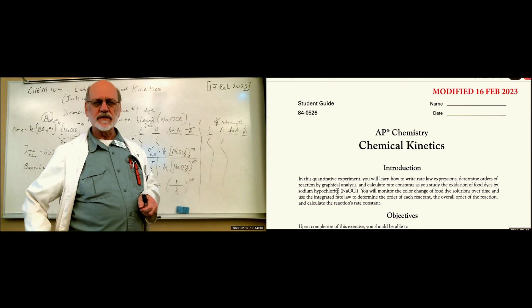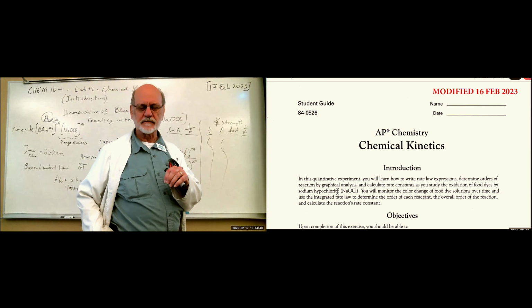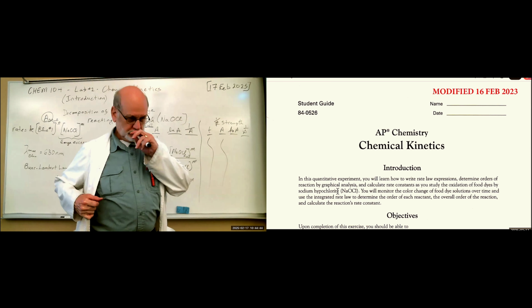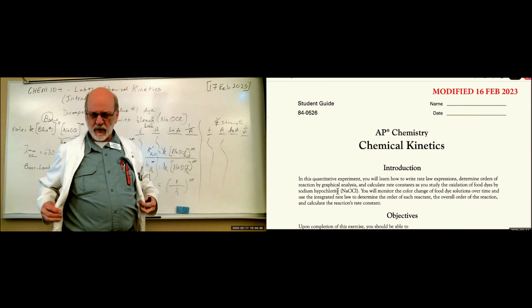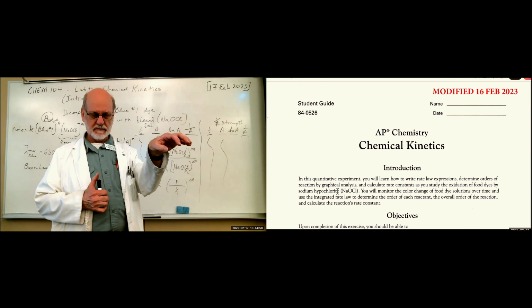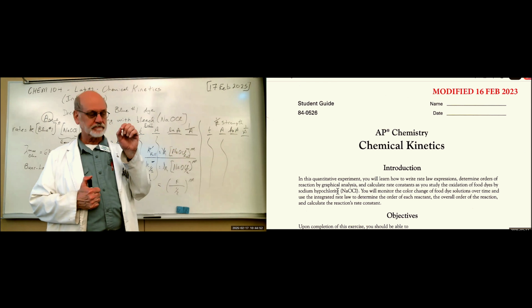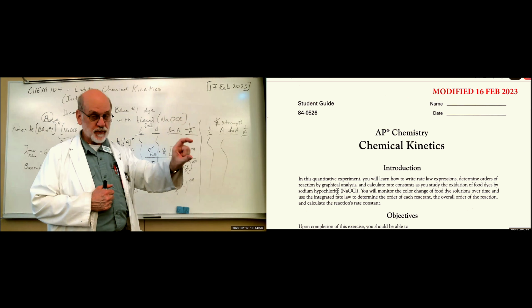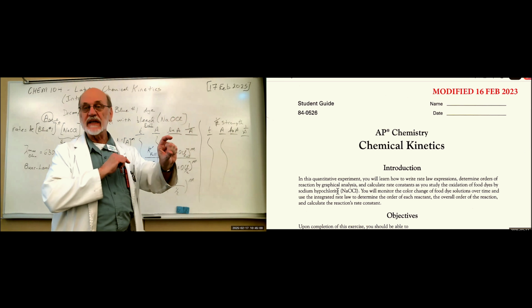The experiment itself requires coordination. Right, got somebody that's actually, because when you finally set up your experiment to occur in the spectrophotometer, the last thing you add to the mixture in that cuvette that's in your spectrophotometer is the bleach.